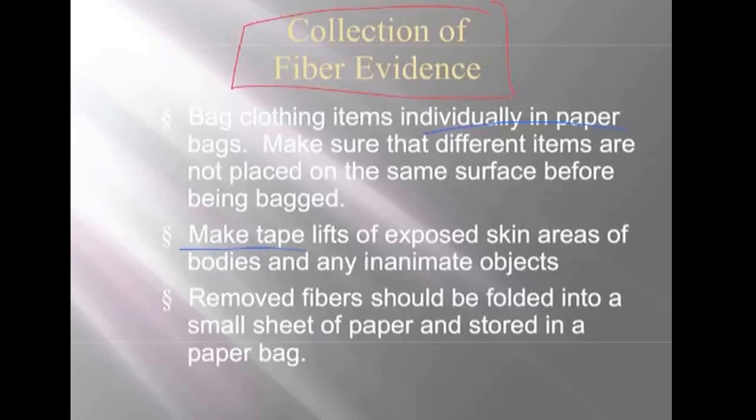And if you are picking up smaller fabrics or smaller fibers, you're going to be doing tape lifts. You'll lift it, and it'll hopefully cling to the adhesive, and then you'll fold that in on itself, or you'll put it on a white piece of cardstock, to trap the fiber in there. Any fibers that are collected without tape are going to go into an envelope, and you can make those in the field if you don't have an envelope with you.